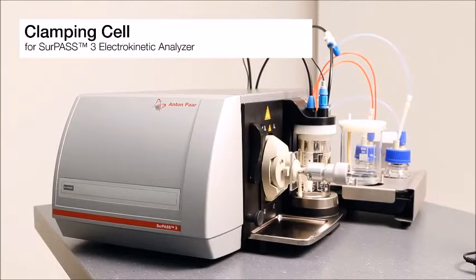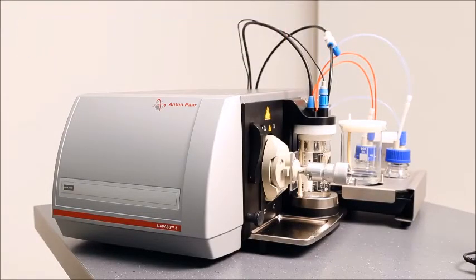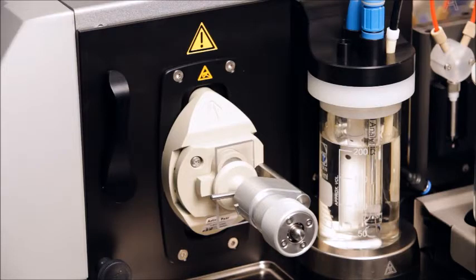This is the clamping cell for the SURPASS-3 electrokinetic analyzer. It's a measuring cell for analyzing flexible surfaces such as polymer foils or rigid samples such as semiconductor wafers. A great advantage of this cell is that it allows for a non-destructive analysis of your sample.